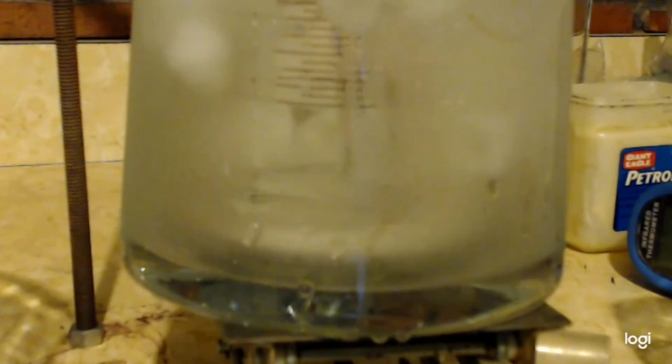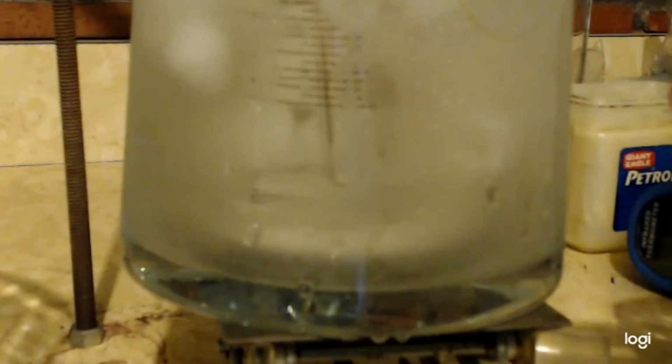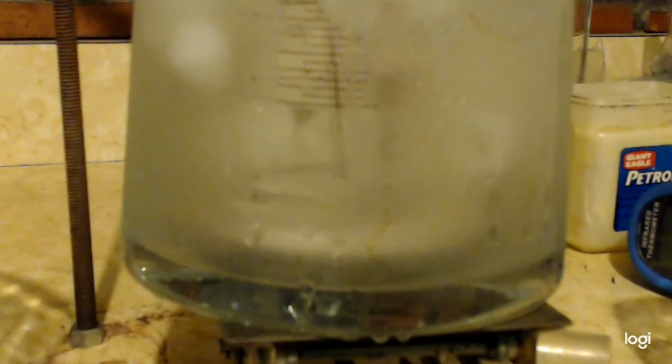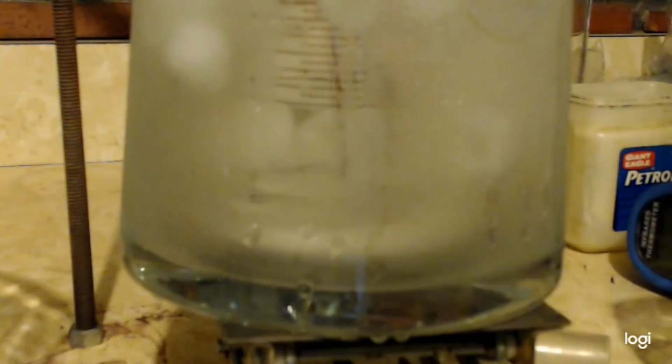It's taking me a while to get it up to the temp because I don't want to break my 2,000 milliliter flask. But basically, it's just a waiting game. Don't want to go too fast. You don't want to go slow either, to where you're going to suck back stuff. So we're just going to keep doing this until, I don't know, we'll see.